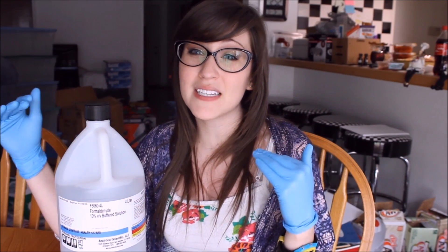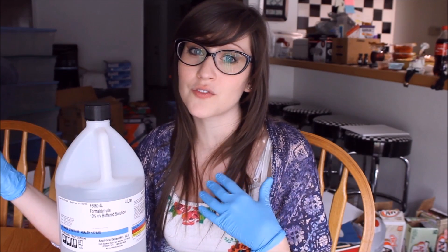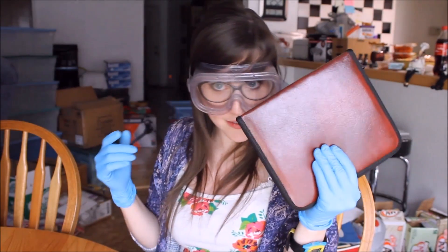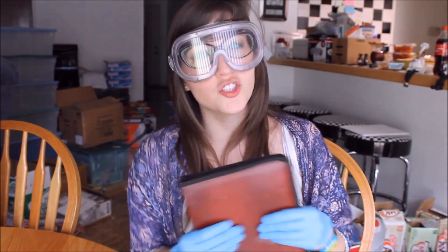Here's my liter of formalin. I use it very wisely and try to preserve it because these run about 30 to 40 dollars per gallon — I have a gallon. They can run maybe 50 to 60 dollars depending on where you get yours from, but I got this for about 40 dollars. Alright, so we have our gloves, we have our goggles, and we have our surgical kits with our scalpels. Let's get going and excavate those organs from those mice.